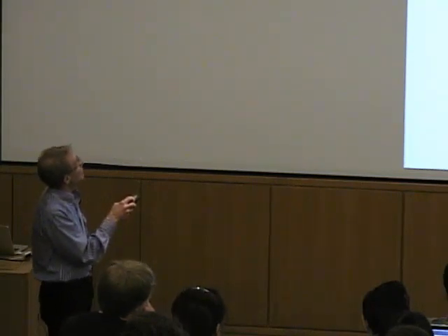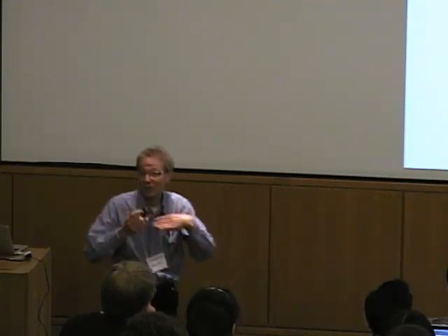Okay, now talking about, question? Okay. So focusing on these last 2 points, this idea about pH and these coupled equilibria are very common. If you're looking at protein binding to DNA, there's probably less proton flow associated with that, but we do have to worry about that, and you need to account for it.